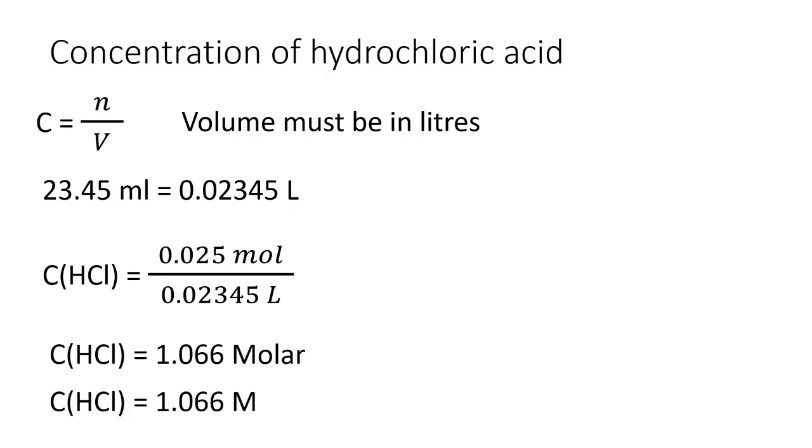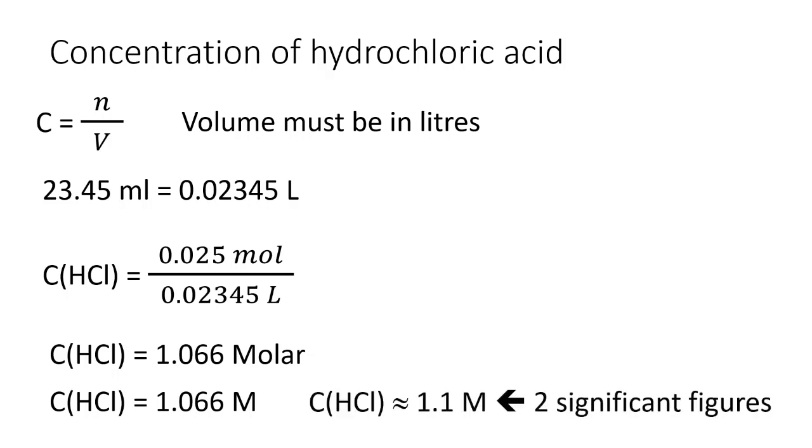That's the concentration or the molarity of the acid. And that's what I was meant to find. That was the purpose of the prac, to find the concentration of acid. And I round that off to 2 significant figures. So I have finally achieved my objective.